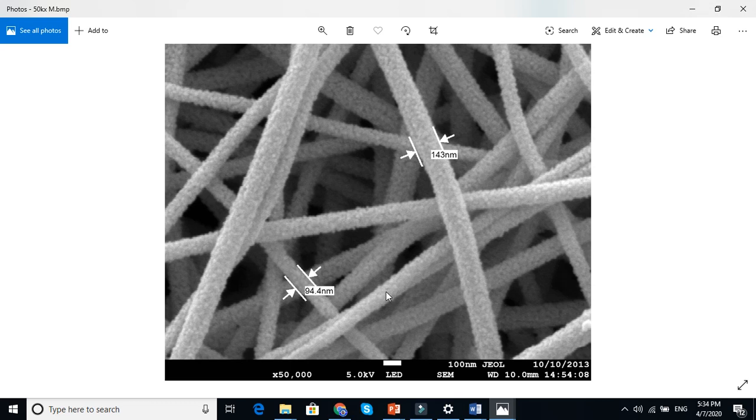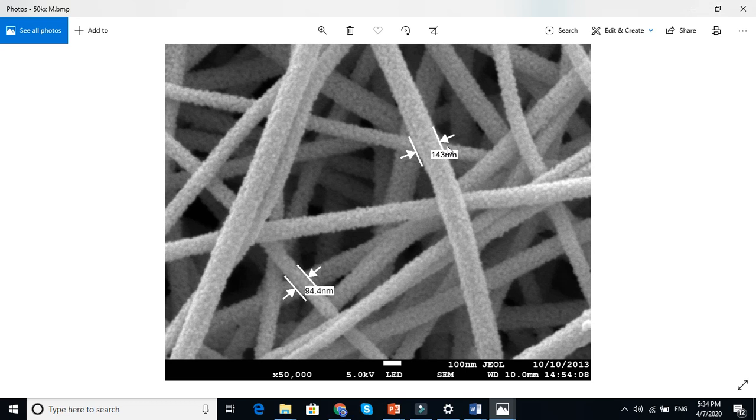...thousand nanometers. So anyhow, from this we can understand that the fiber diameter is something like average 100 nanometers.